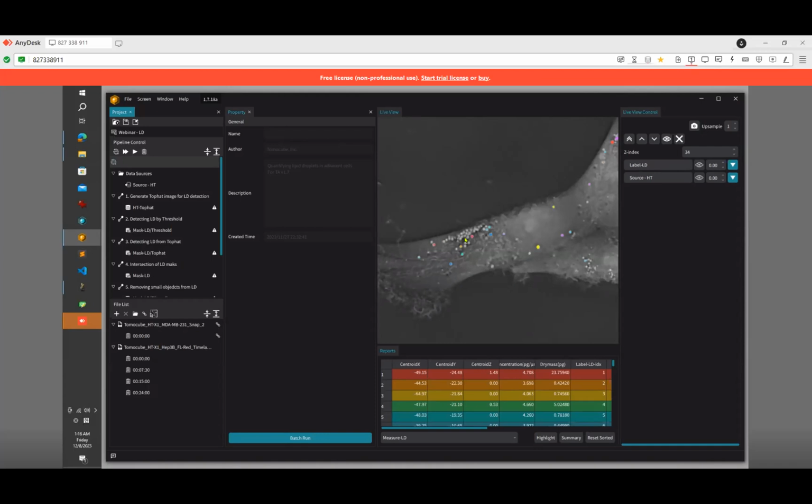But the basic idea here is following the basic criteria, which are more general. Sometimes in human eyes, you think you need more modification to track all the things, but just be cautious because the data is in 3D, and you should go up and down like this to see if the criteria are really missing or not. So in this way, you see how the LD is detected here.